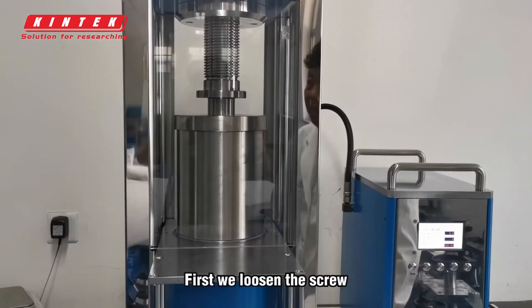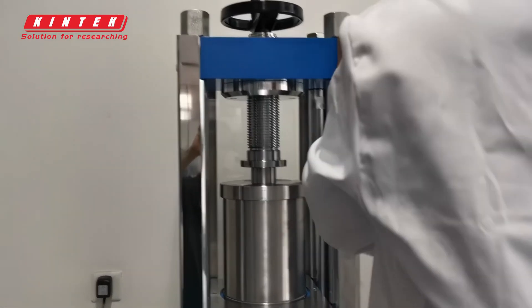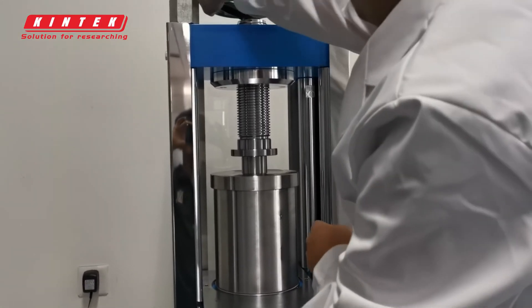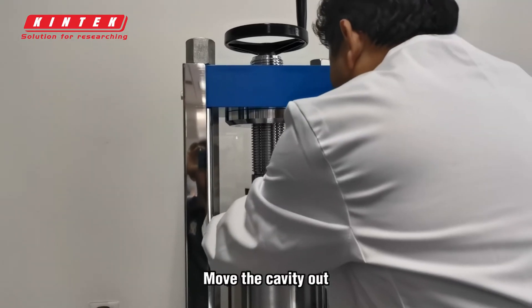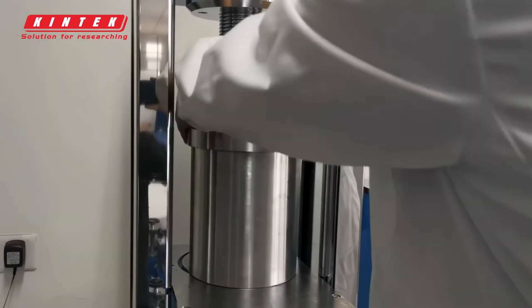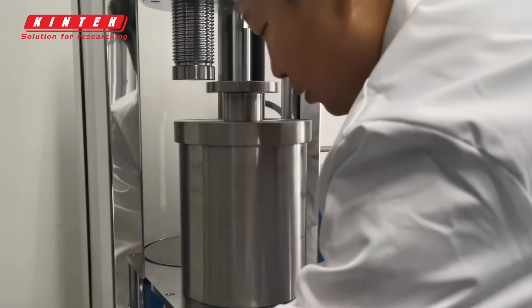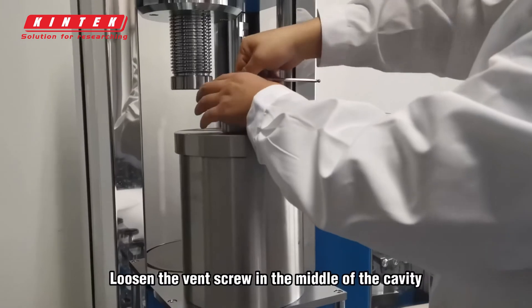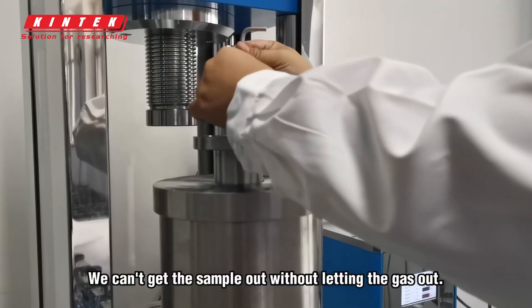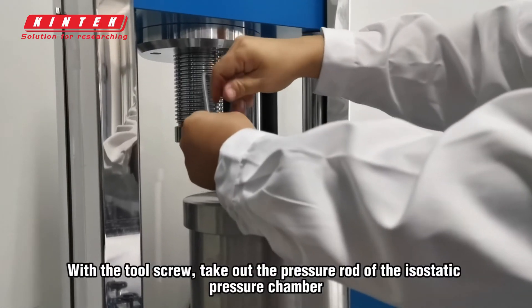Now the automatic depressurization is complete. Now we take the sample out. First we loosen the screw and move the cavity out. Loosen the vent screw in the middle of the cavity, because there is high pressure gas inside. We can't get the sample out without letting the gas out. With the tool screw, take out the pressure rod of the isostatic pressure chamber.